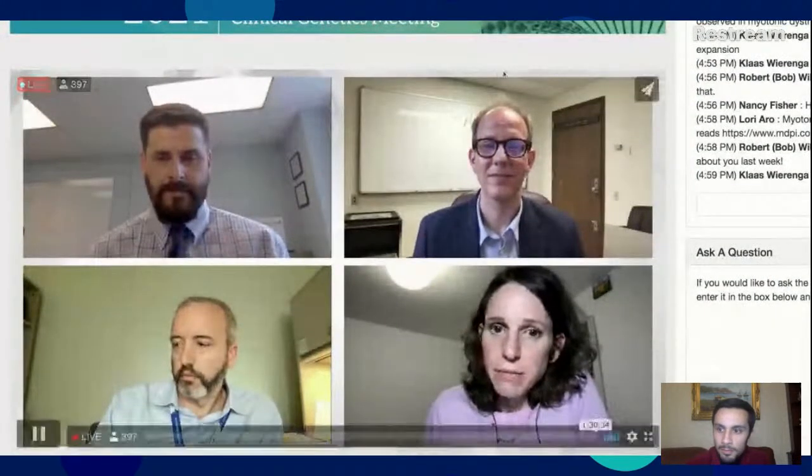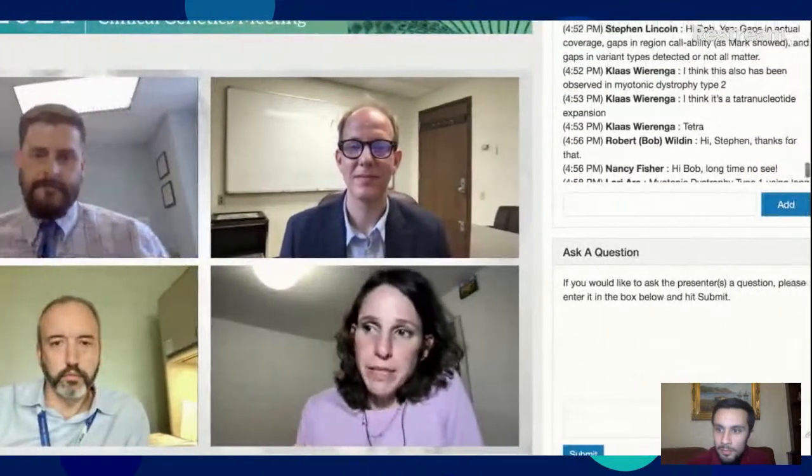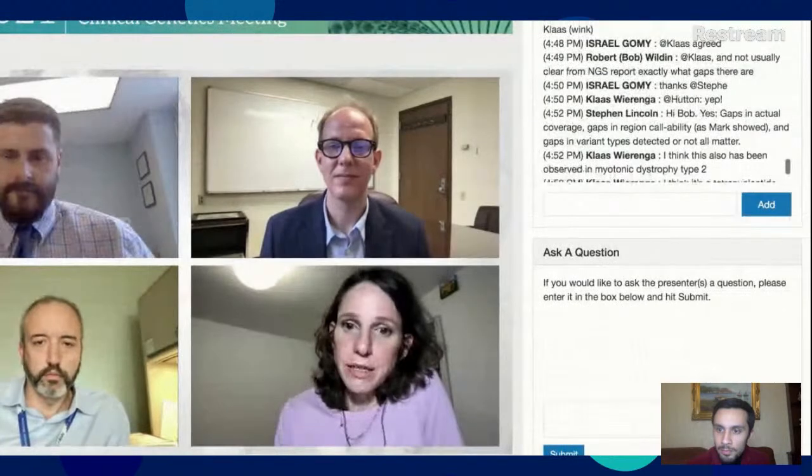Question for Ariana. Quite a few questions on different expansion repeat callers that could be used. Can you comment a little bit? You used ExpansionHunter. Do you have any experience with other software or approaches? Yeah, well, we started this work in 2017, and by that time only two software tools were available, one called HIPSTR and ExpansionHunter.